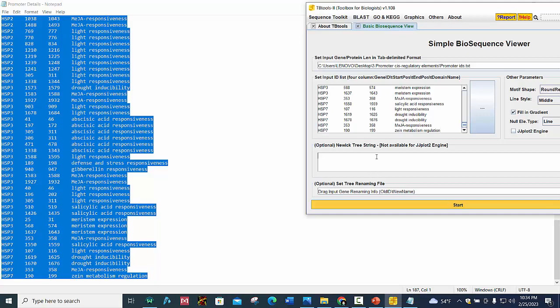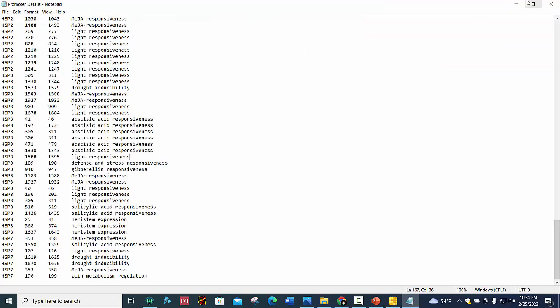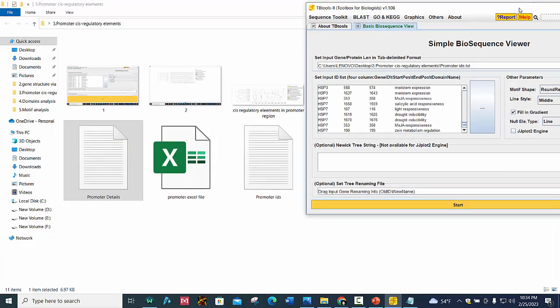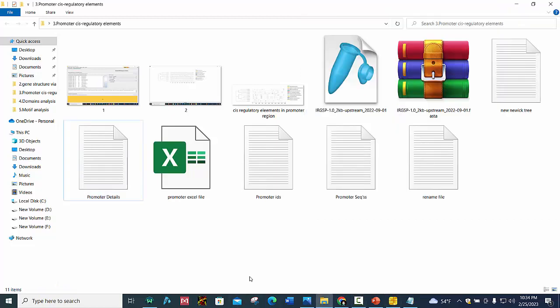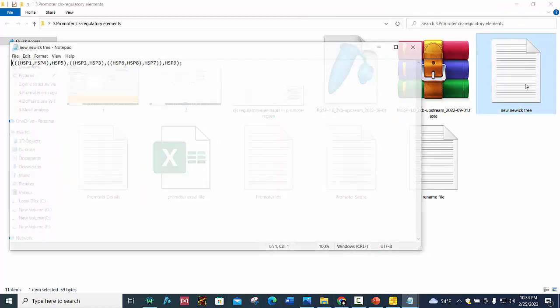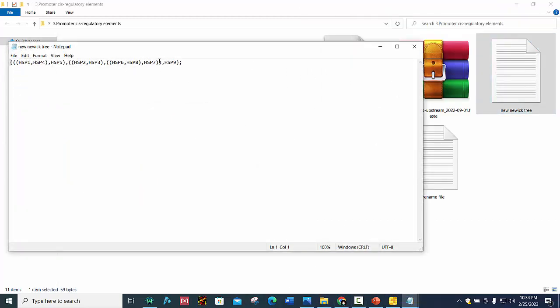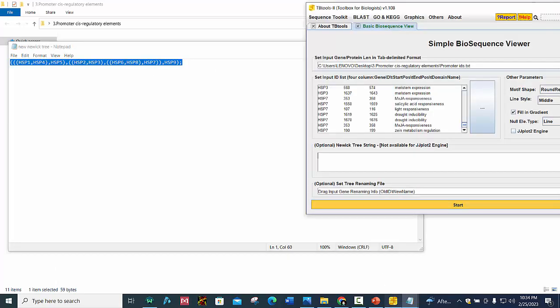And here we place our Newick tree. Copy this and paste it here.